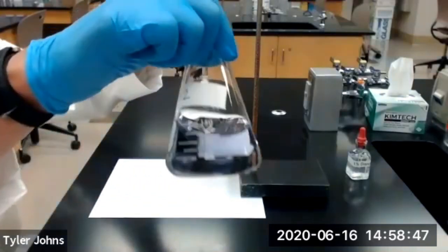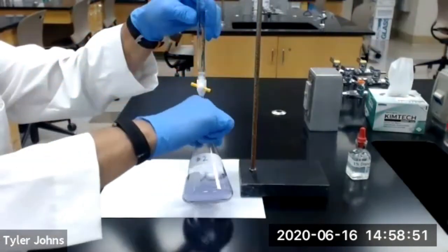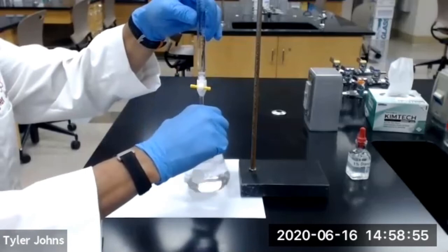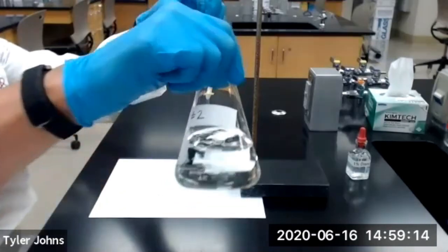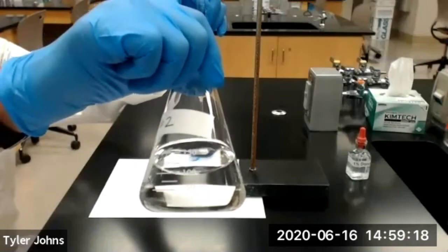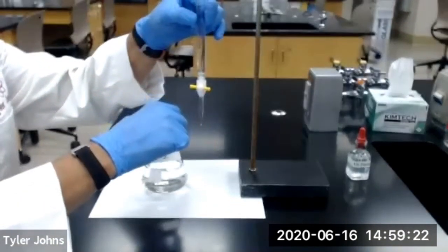We still have a very faint blue color, so we need about another half drop from the burette. Our solution in Erlenmeyer flask number 2 is now clear, so we have reached the endpoint of our titration for trial number 2.